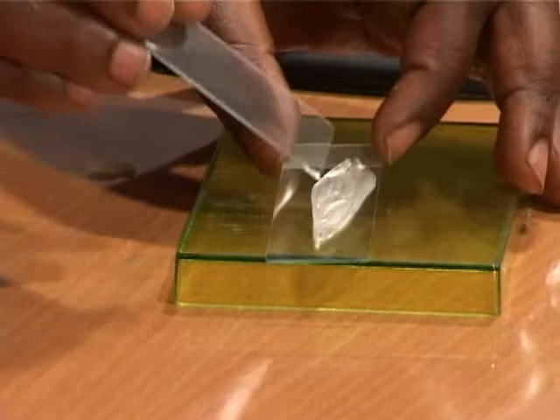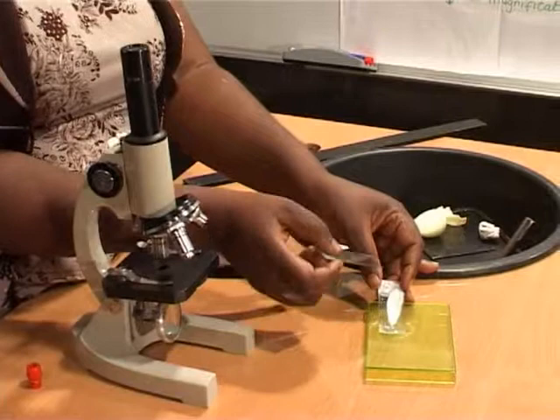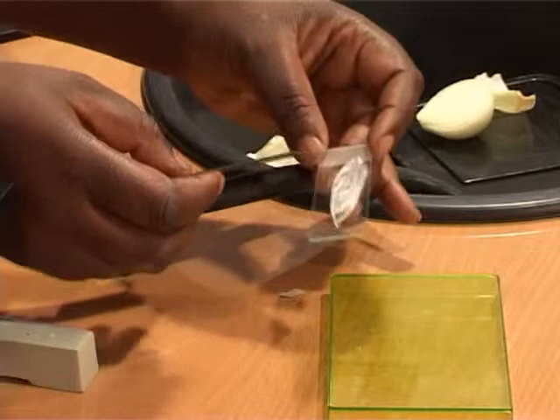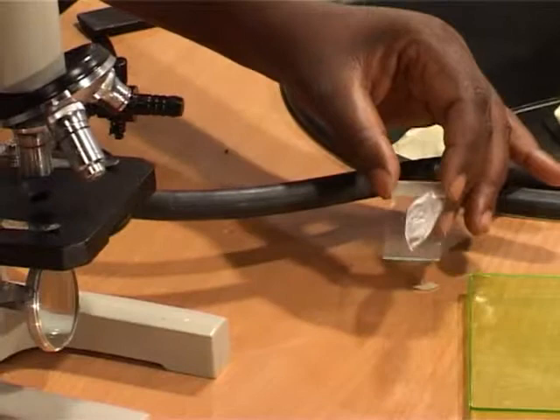If your membrane is a bit dry, you add some water, then you drain the water. It has to be removed. You remove the bubbles as well. After that, you take your specimen. Specimen is the thing that you are observing under the microscope. So, since we've done this, now let us put our specimen on a microscope.